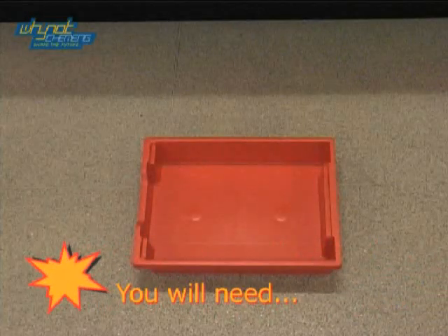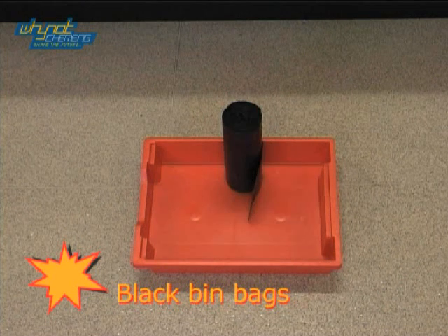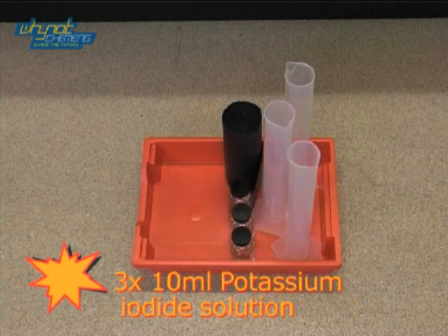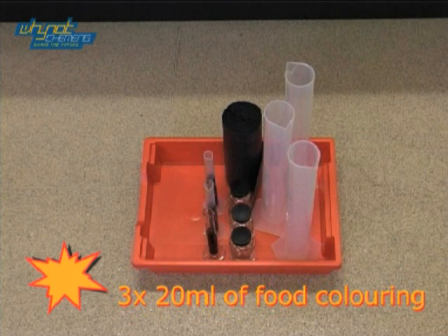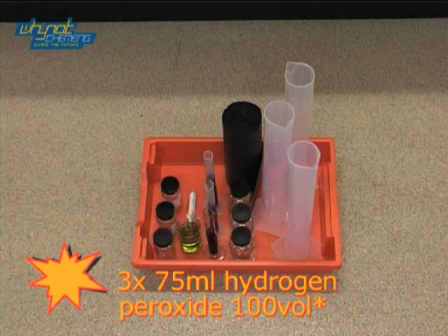At number 5 we have lots of frothy foam. For this demonstration you will need black bin bags, three 500ml measuring cylinders, three times 10ml of potassium iodide solution, three times 20ml of food colouring, a 100ml beaker of washing up liquid and a syringe, and three times 75ml of hydrogen peroxide.